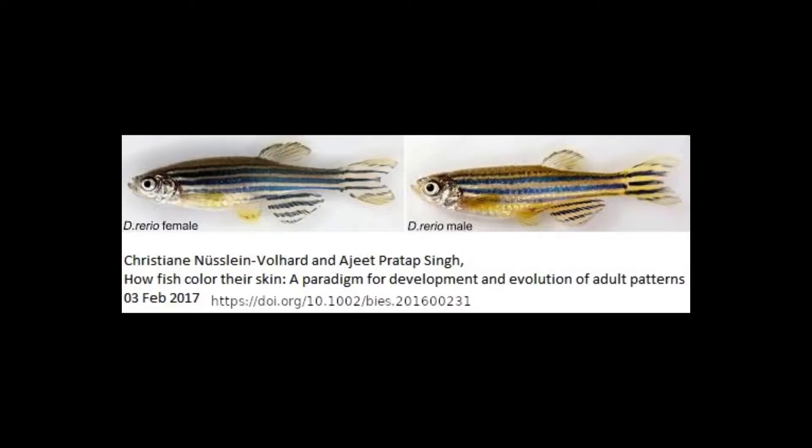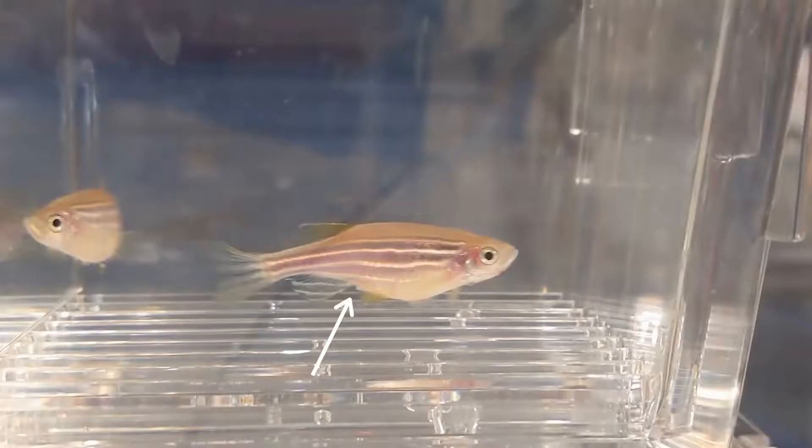When breeding zebrafish, we first have to sex them. Males tend to have a torpedo-shaped body and brighter colors, whereas females are rounder, have dull colors, and they also have this ovipositor that the arrow is pointing towards.